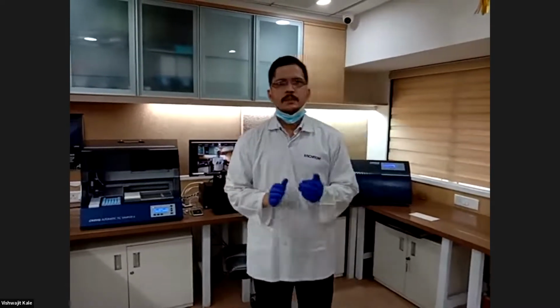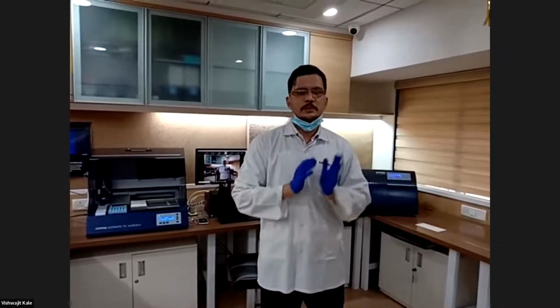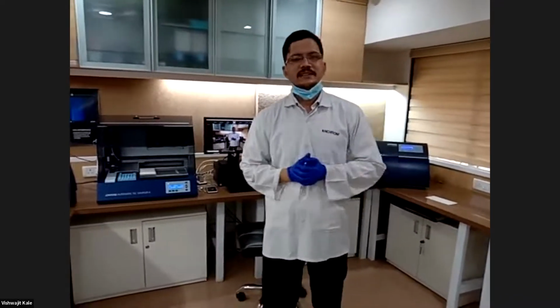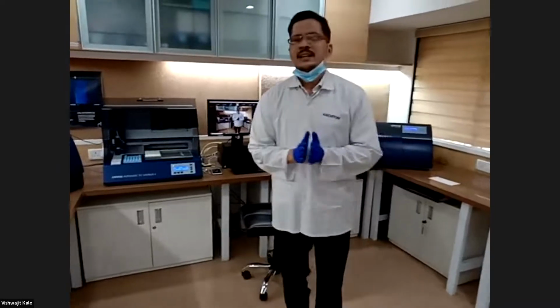I will start from stationary phase selection, right from the plate, because whatever separation is going on is on the HPTLC plate or TLC plate. That is the stationary phase, because in chromatography there are two phases, stationary phase and mobile phase. As per the chemistry of our molecule of interest, the analyte in our hand, we need to select a suitable stationary phase.